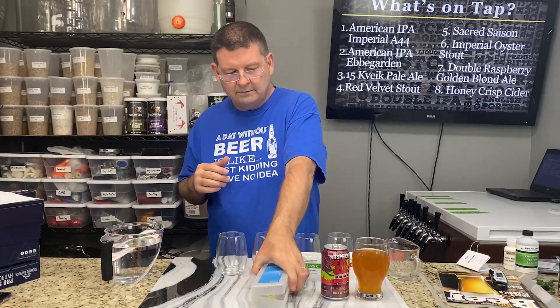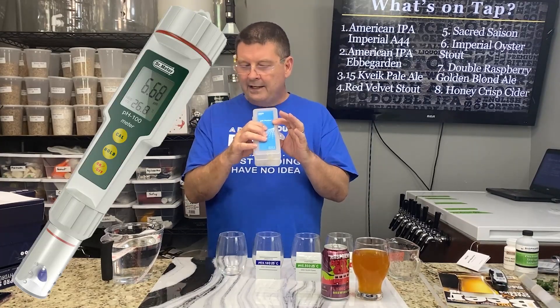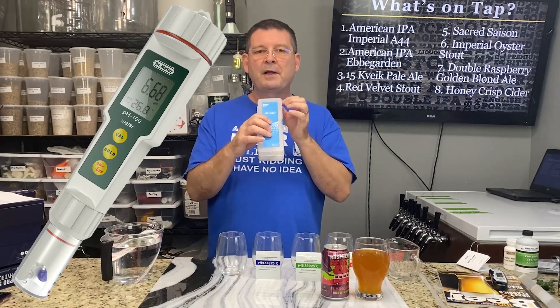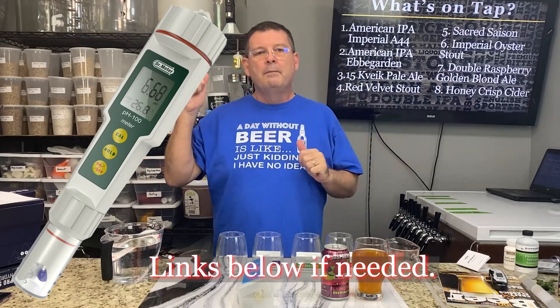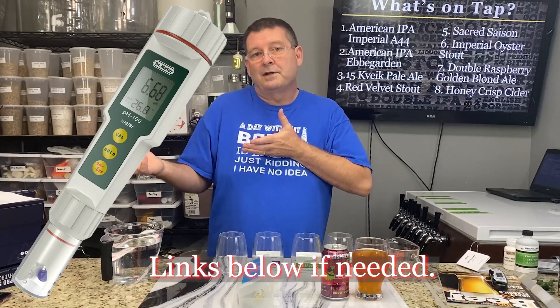Hands down, I've been using the Doctor pH meter for a while and it's worked great for me up until recently — and I'll explain why. It runs about 30 bucks. You can get it on Amazon. I'm going to put a link down there. Right now I think it's $32 with 5% off, which brings it back close to 30 bucks.